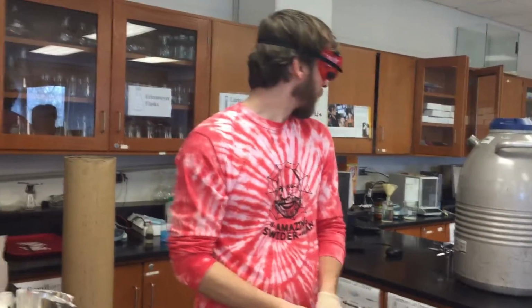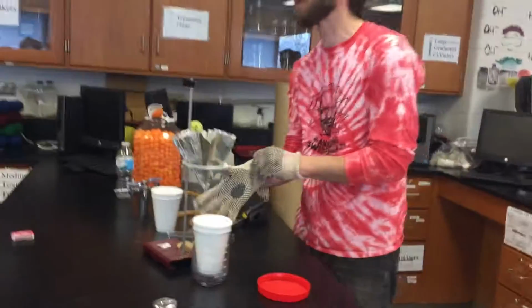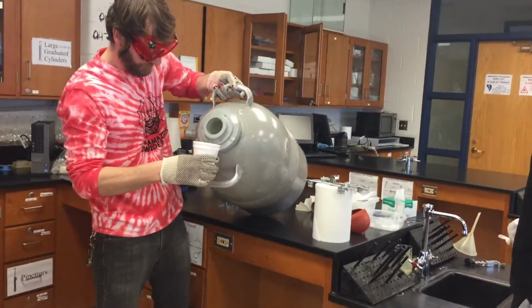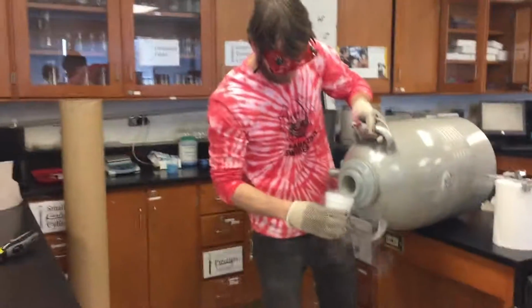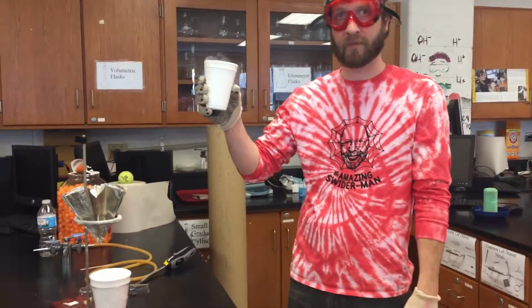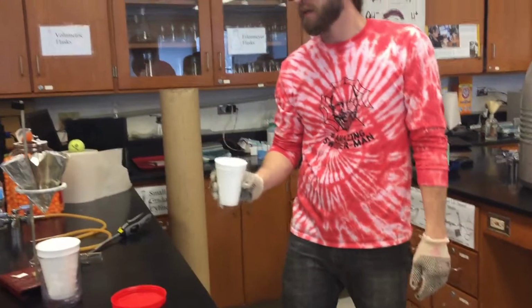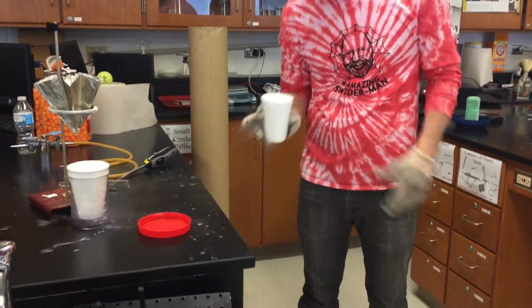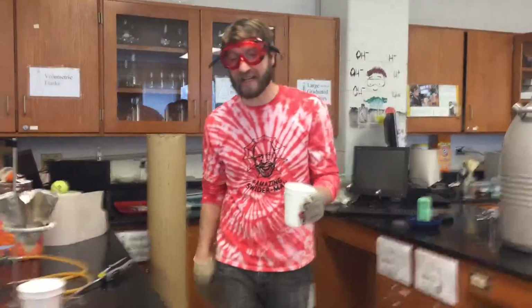Okay, so I have a substance here for you guys in this big gigantic container called a Dewar flask. It's not dry ice. Dry ice is a solid. This is liquid nitrogen, N2.